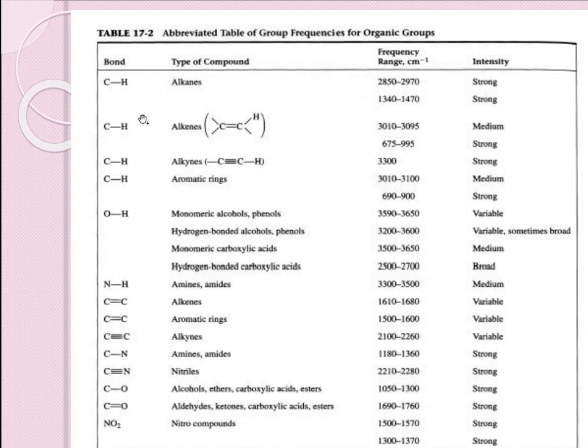So the overall bond and the type of compound, frequency range and intensity have been shown in this table.